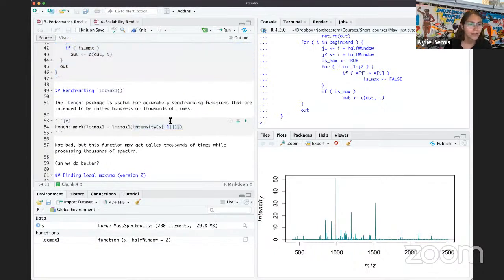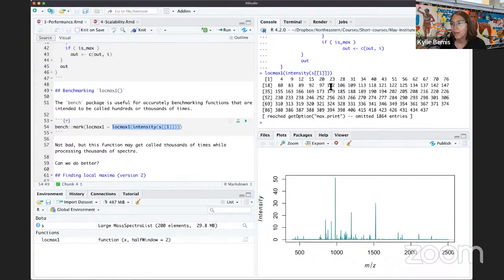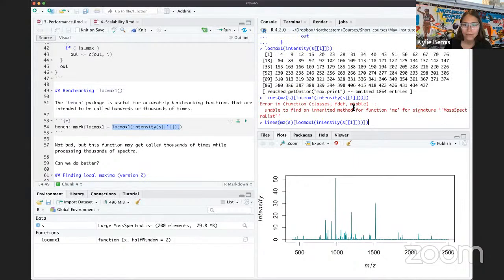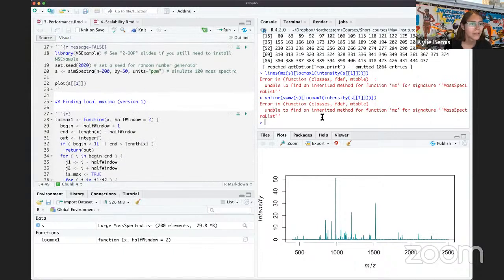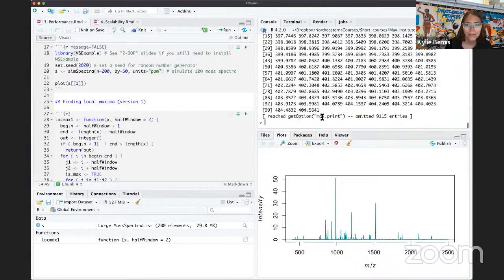And so here is what I get when I run this. Let me go ahead and try to highlight where these are occurring. There we go.